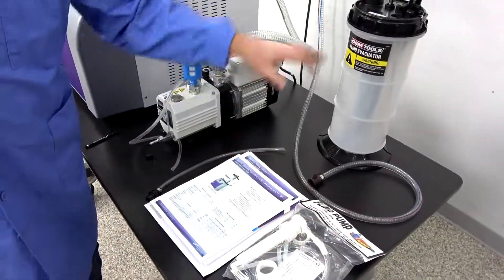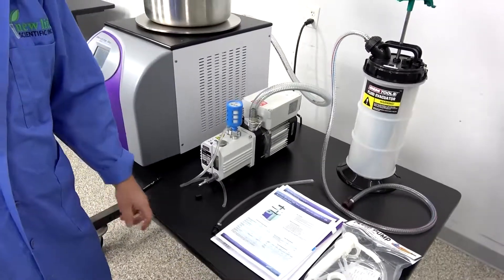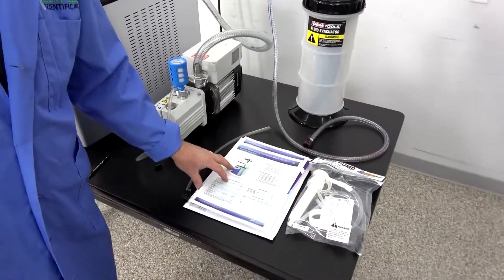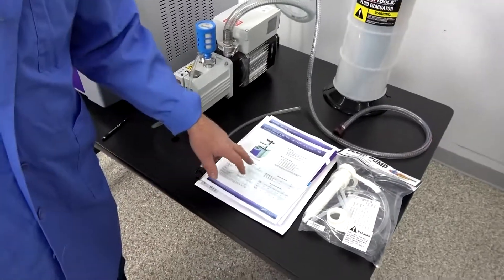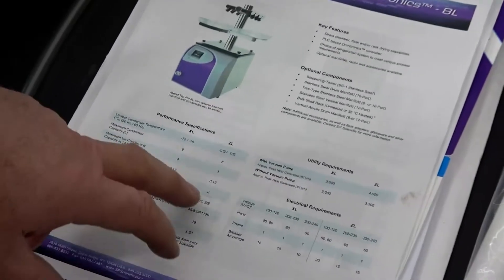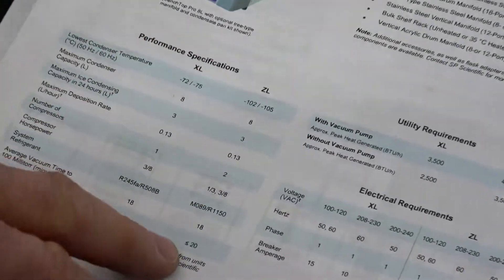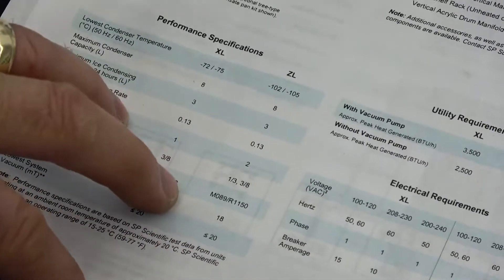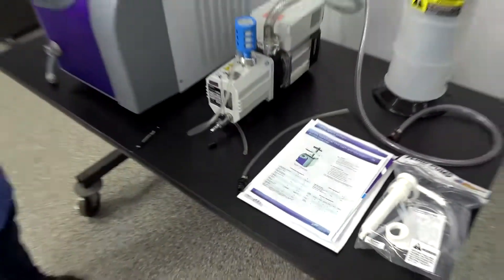So we're including that, we're including the evacuation pump, and it also has all the original literature from the first owner. As you can see, this one is actually the ZL model 8 liter, and it has all the specifications here — just a really beautiful unit.